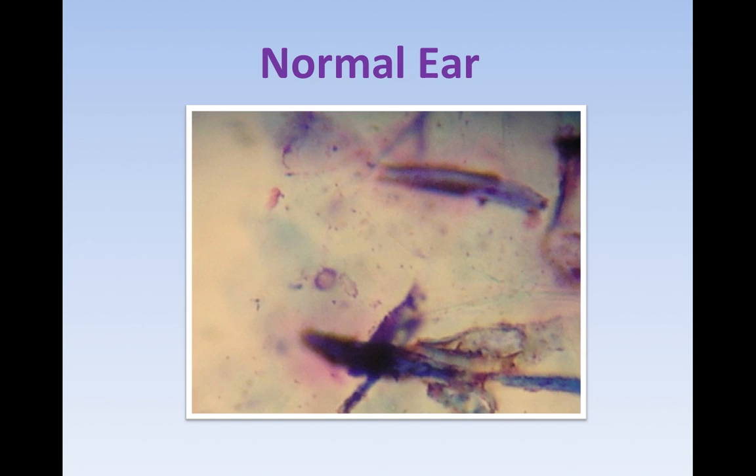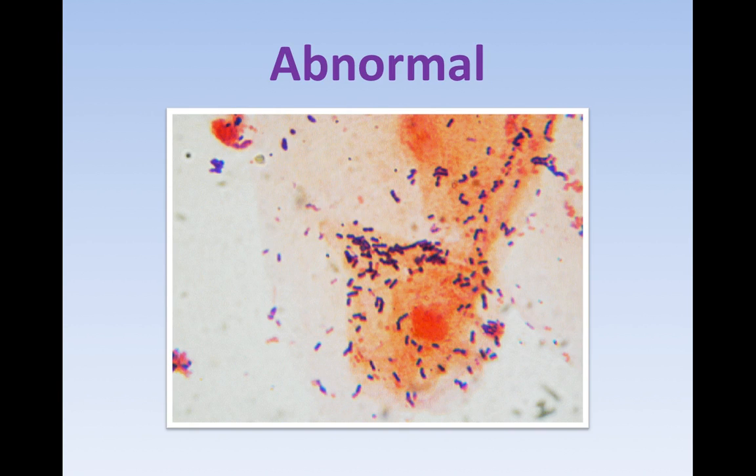This is the cytology of a normal ear. What we're looking at are rolled-up, dead keratinocytes — they look like cigars. Those little dots in the background are not bacteria, because they're all different sizes and different variations in color; bacteria tends to be quite uniform. It's just general keratinocytes and cell debris — not a lot going on. Sometimes it might show up as a little bit brown or yellow.